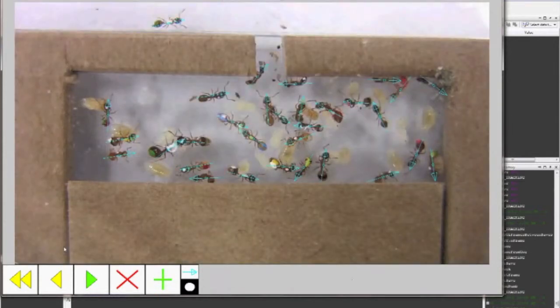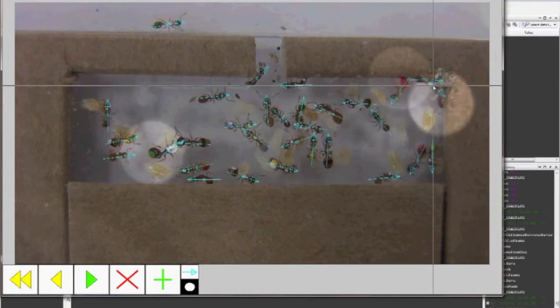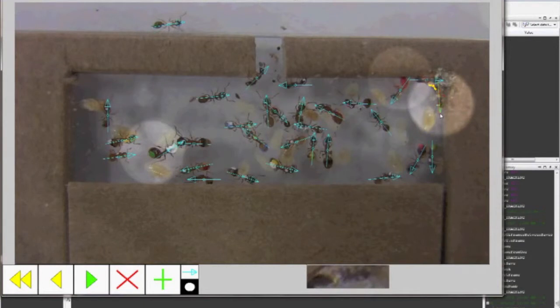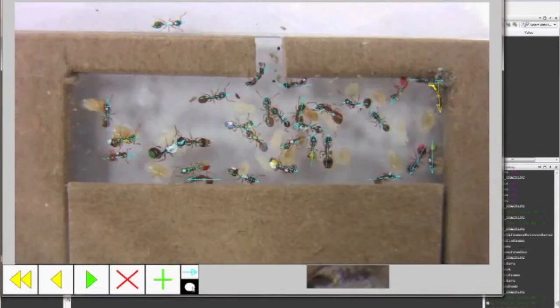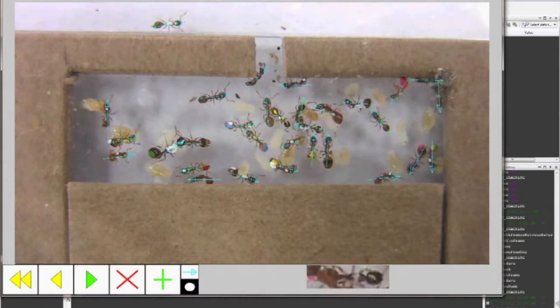Search the entire frame for errors. Sometimes there will be no errors — if this is the case, press the green play button to continue tracking. Most times, however, there will be an error. When you find an error, right-click in the center of the incorrect tracking arrow, then left-click in the center of the ant and in front of the ant's head as you did before. If you wish to brighten the frame and get rid of the highlighted areas in order to see more clearly, press the black and white highlighting button at the bottom of the screen.